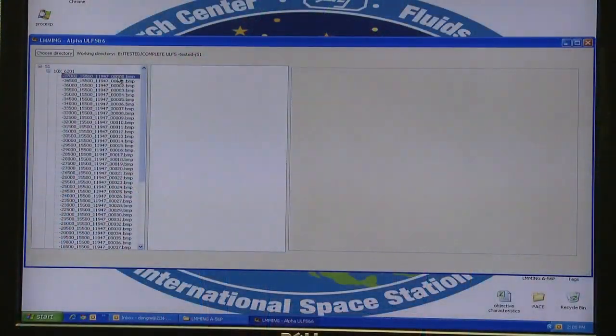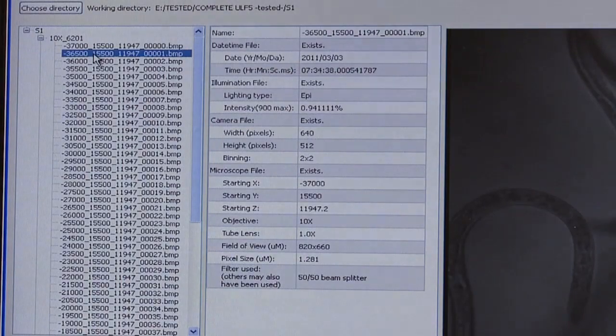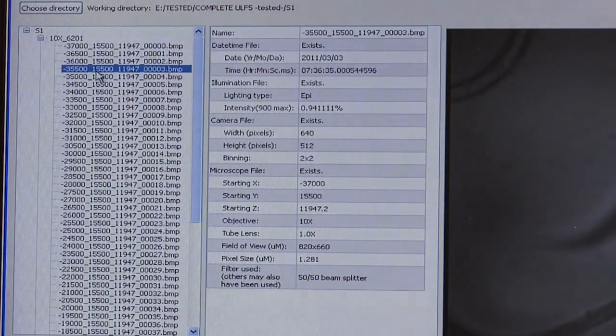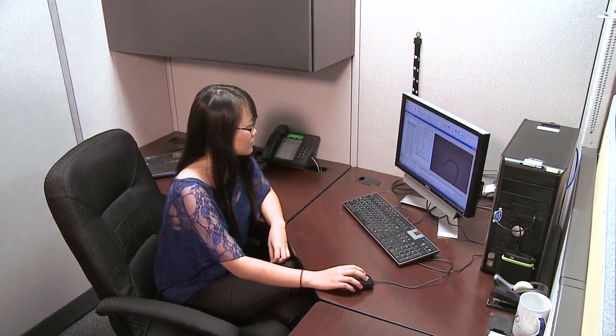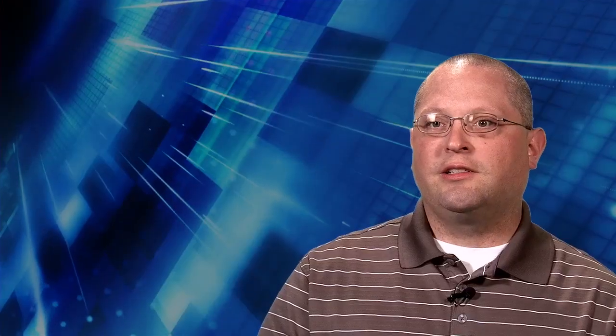There are certain categories of data that are associated with each image. These categories include the name of the file and the date the data was taken, along with the time and other important data such as the filters that were used, the XYZ position of the picture, the type of lighting which includes epi, trans, or LED, and other relevant data. These were all things expressed to me by various scientists as information they need in order to obtain useful information from any given image.